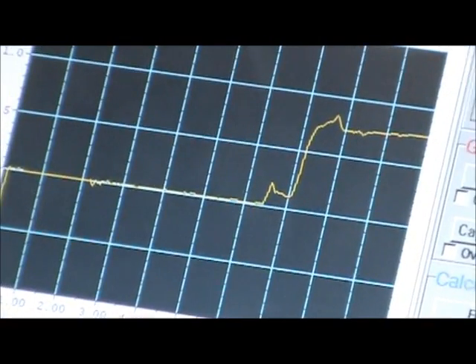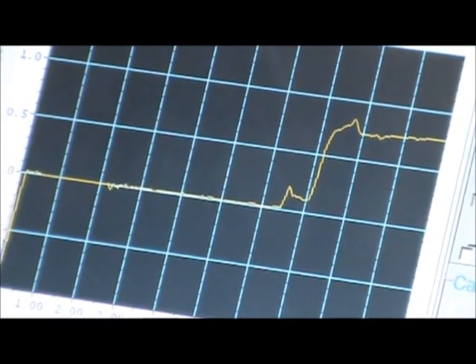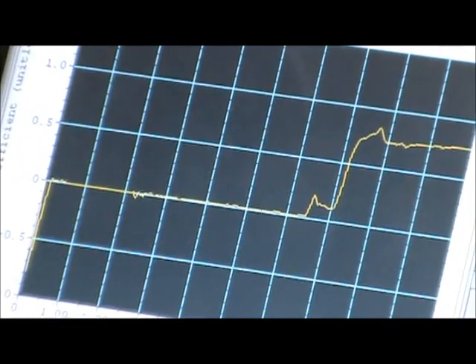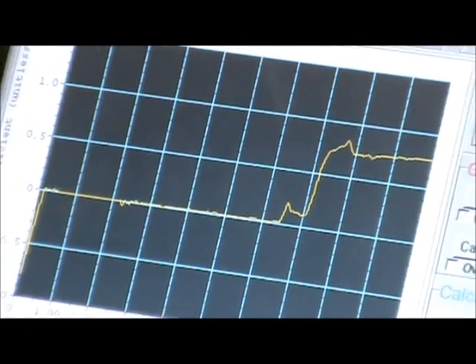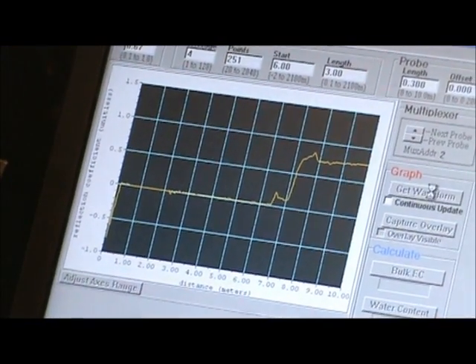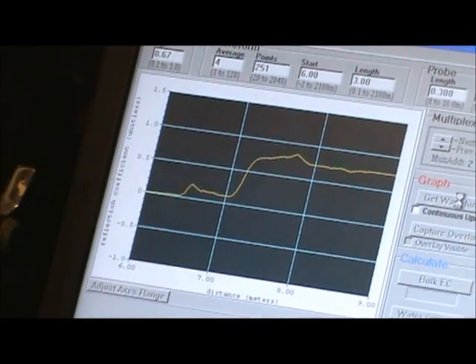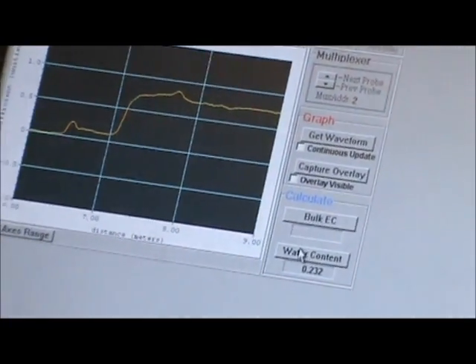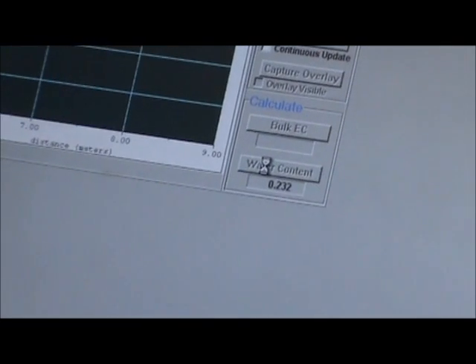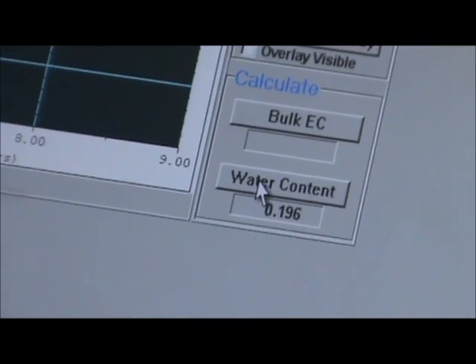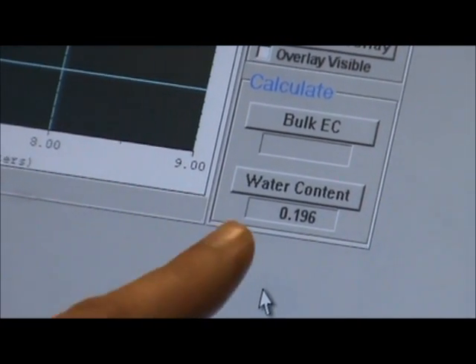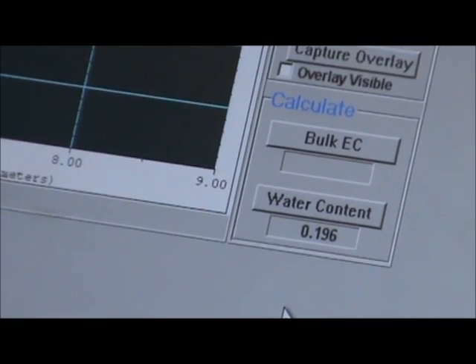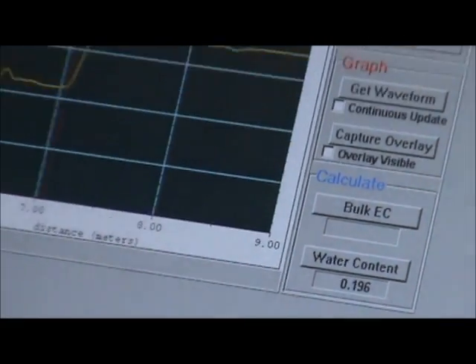So we'll zoom in on that graph, and get the waveform. And then we'll ask the program to calculate the water content. And so here, the second TDR is giving us a water content of 0.196.